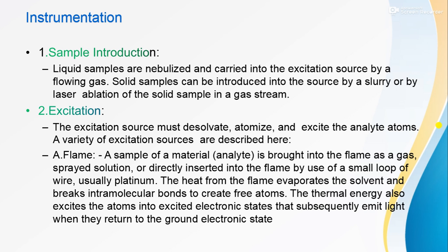Instrumentation. 1. Sample introduction. Liquid samples are nebulized and carried into the excitation source by a flowing gas. Solid samples can be introduced into the source by a slurry or by laser ablation of the solid sample in a gas stream. 2. Excitation. The excitation source must desolvate, atomize, and excite the analyte atoms. A variety of excitation sources are described here.